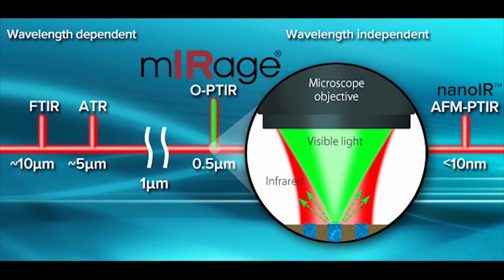The ultimate rough sample was the one I showed at the end where there was a defect 20 microns deep inside of a hole, and we were able to tune the focus down into the hole and get the spectrum. So as long as most of the samples scatter the visible light, it's not been a problem to get spectra.